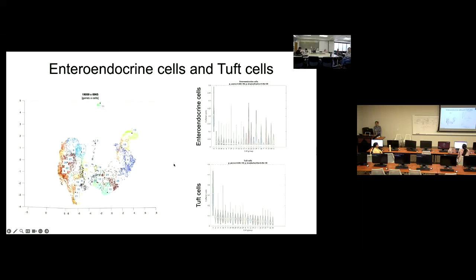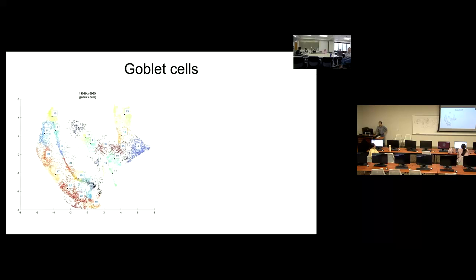That's actually pretty easy and shouldn't be too much. It's just because they actually pull away from the rest of the cells, because they are a differentiated cell type, but they are technically a specialized cell type as well. Expression is so different; they just separate. Yeah, exactly. The other cell types that I can try to pull out are goblet cells.